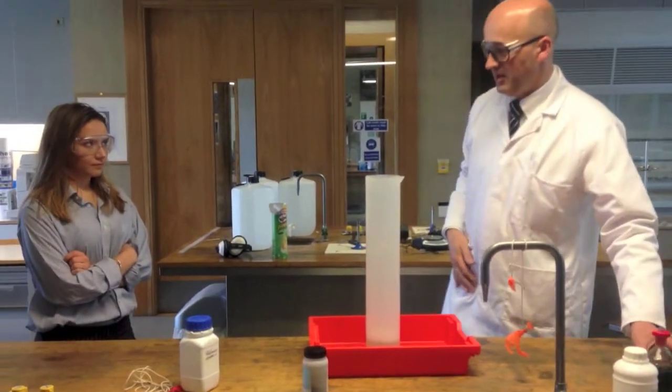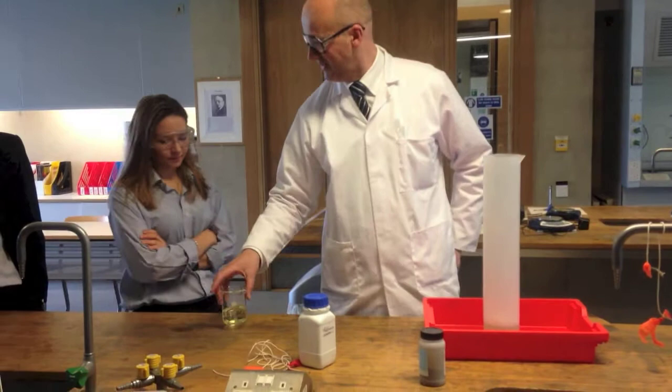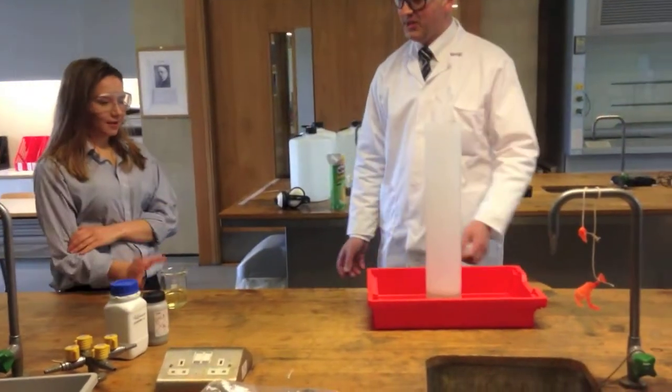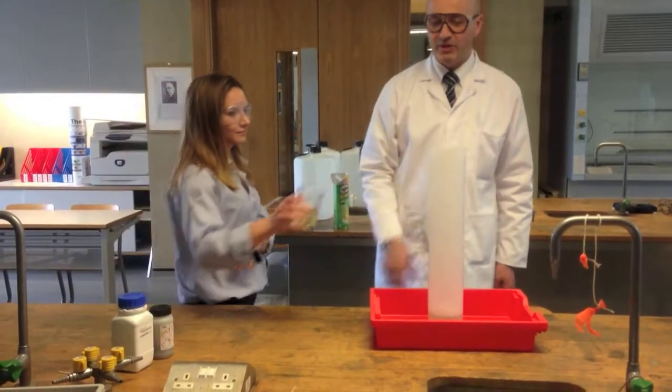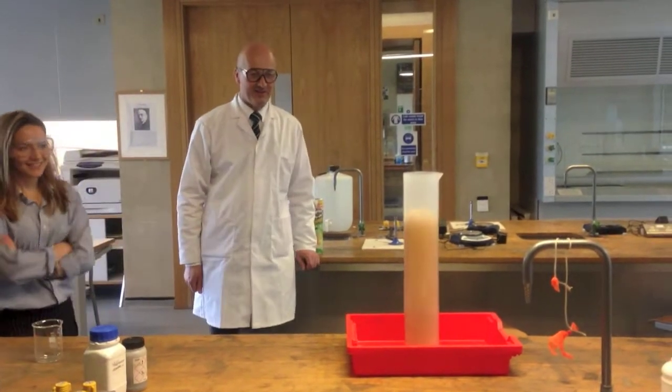That's your iodide. What you need to do — it's not dangerous or corrosive to you. Just pour it in nicely. We can understand that. Like that.